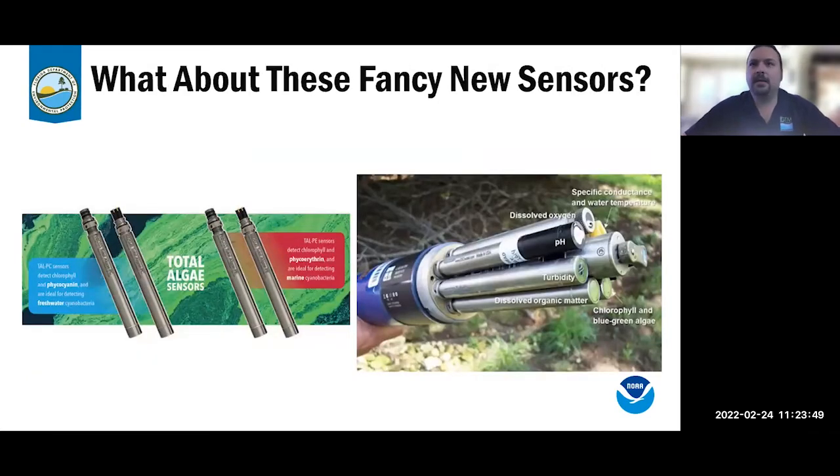So YSI, or Xylem YSI, the manufacturer of the data sondes that we use within the system-wide monitoring program, has developed an optical sensor to monitor chlorophyll fluorescence in situ, or within the environment. Using the EXO data sonde allows for the capability to pair chlorophyll monitoring data taken every 15 minutes with a whole suite of abiotic parameters such as temperature, salinity, dissolved oxygen, pH, turbidity, and the fluorescent dissolved organic matter that Shannon mentioned. So implementing the sensor into the SWMP program provides a rapid and autonomous way of monitoring chlorophyll fluorescence. These sensors are intended to complement monthly discrete sampling efforts in an effort to paint a better picture of the temporal variability of our estuary.